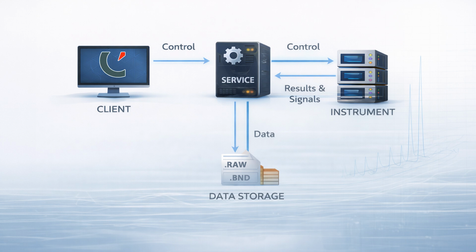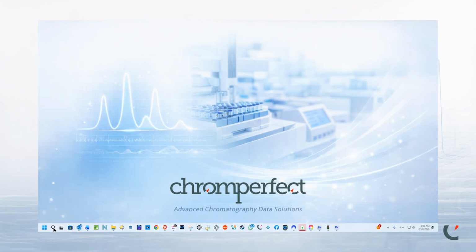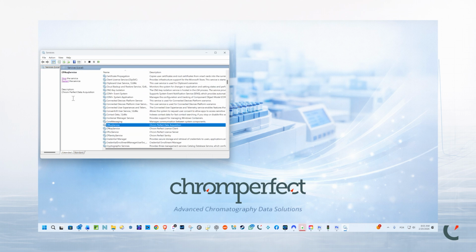The Chromperfect Service is the background engine of the system. It runs at the operating system level as a Windows service and is responsible for instrument communication, data acquisition, and maintaining active run control. The service operates independently of the user interface. It normally starts automatically with Windows.